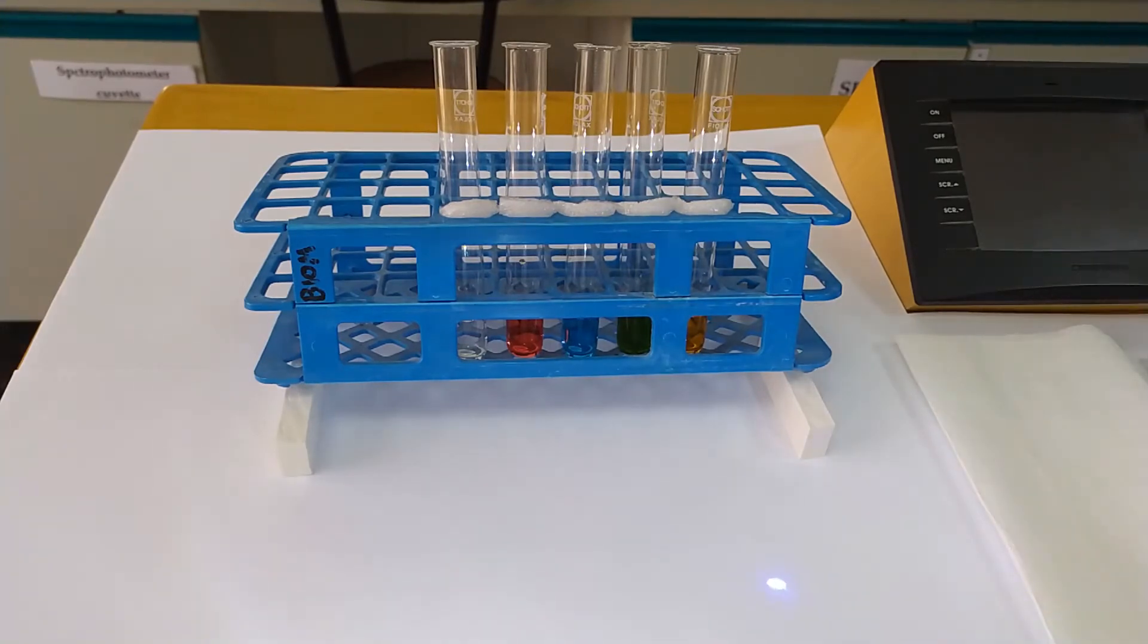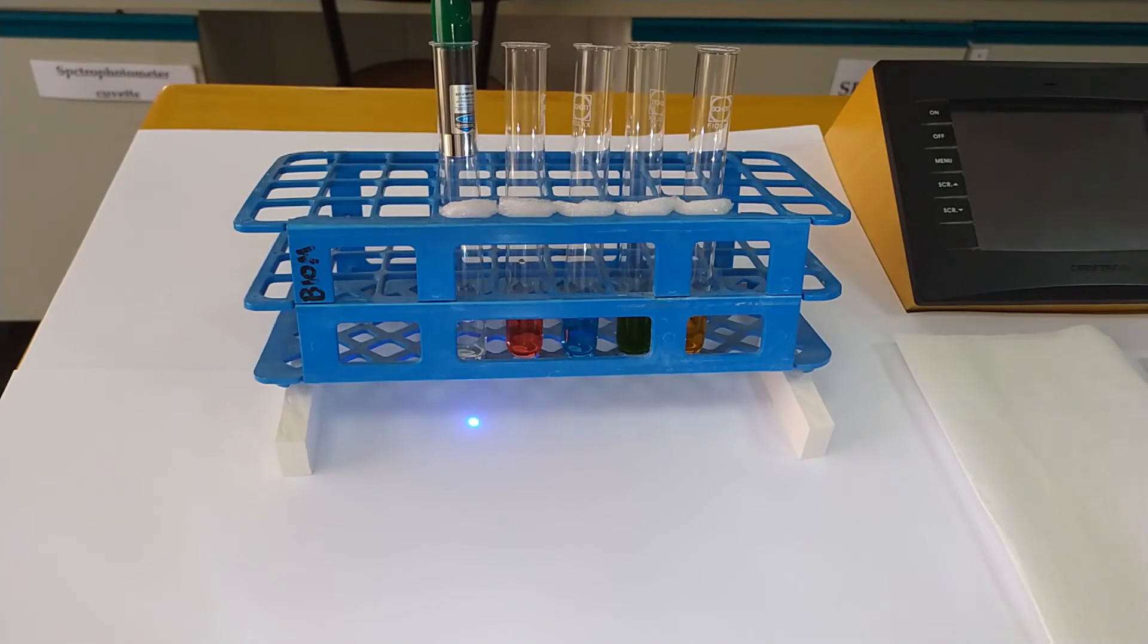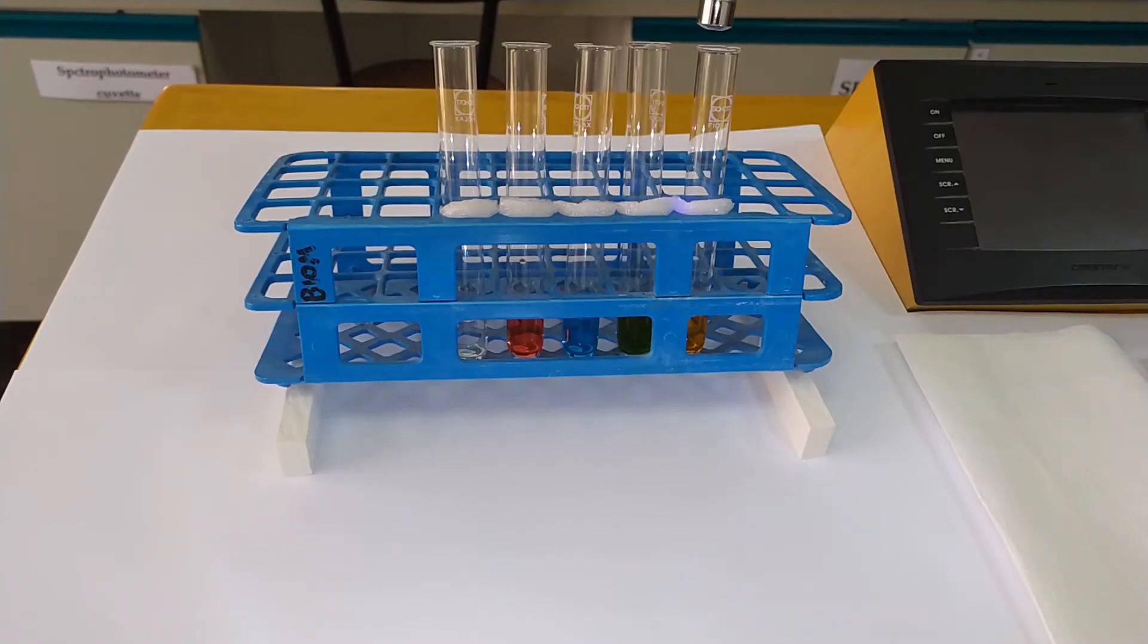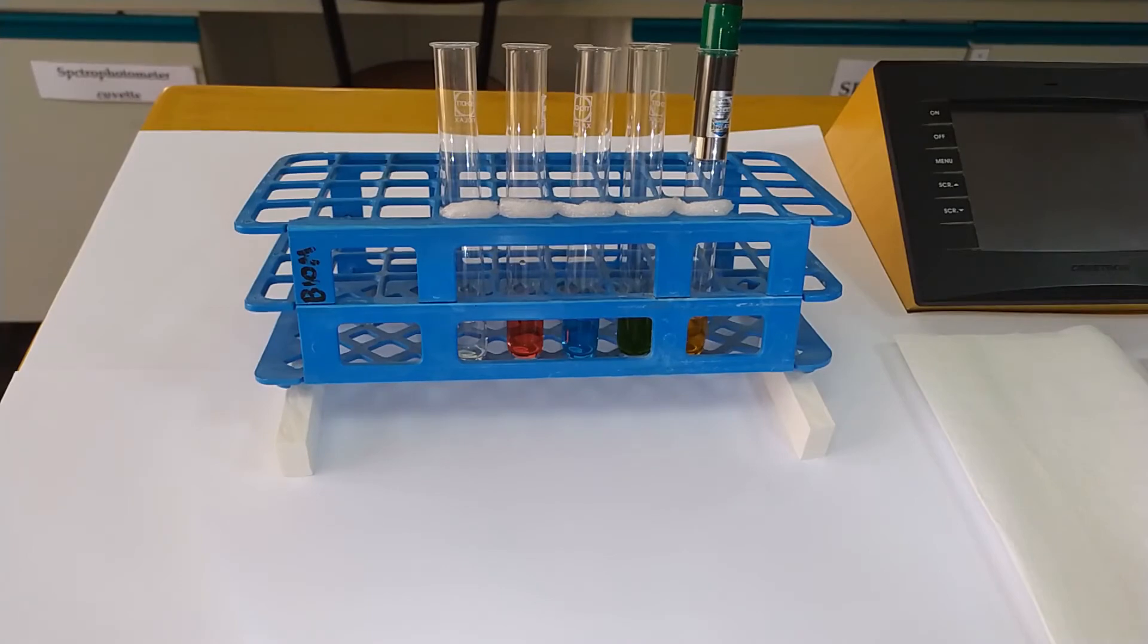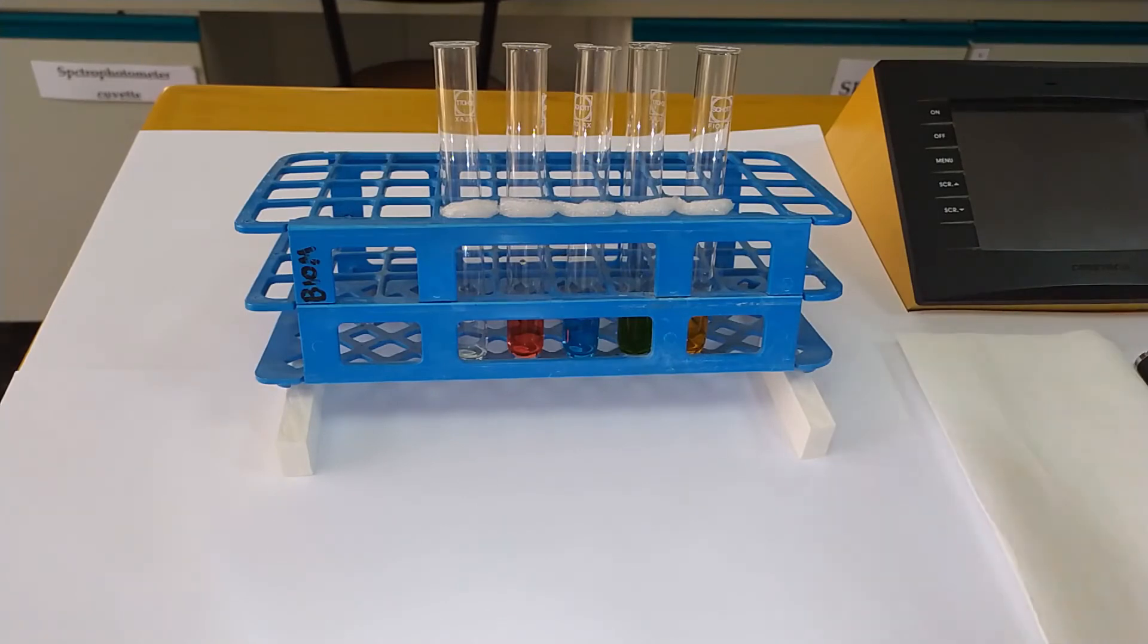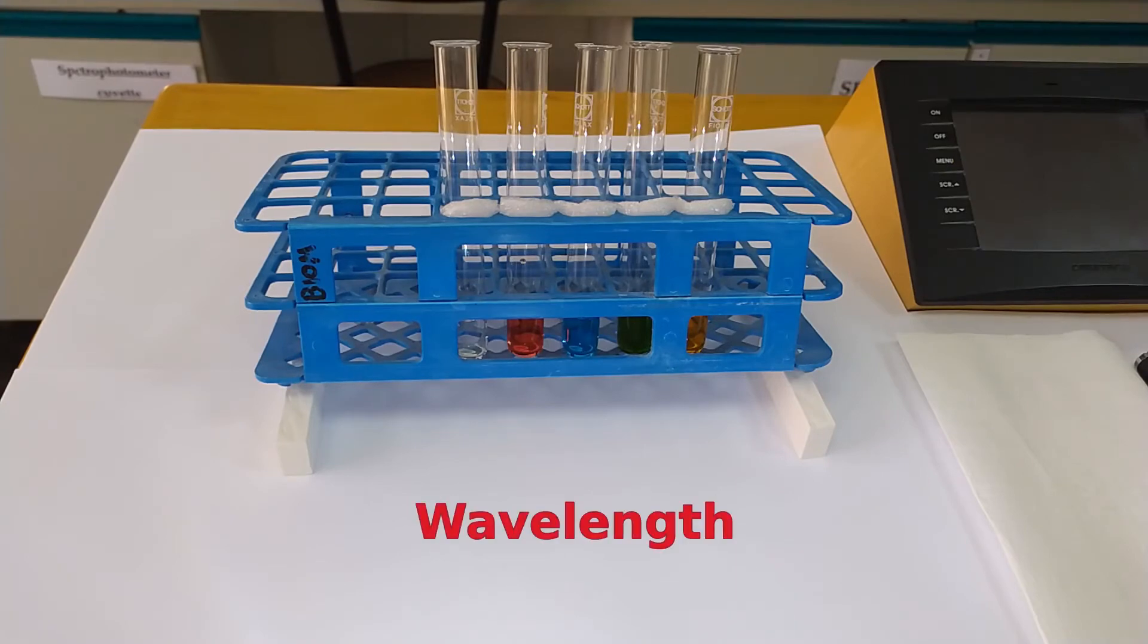Now let's try this with the blue light. It passes through the water just fine. It is being absorbed completely by the red solution. It's being transmitted by the blue solution. And it is blocked again, or absorbed, by the green pigment. And also by the orange solution as well. So, as you can see, whether a colored light passes through a solution really depends on the color of the molecules in that solution. Some molecules absorb some light colors or wavelengths, and other molecules absorb different light colors or wavelengths.